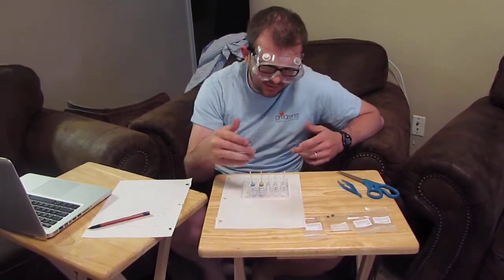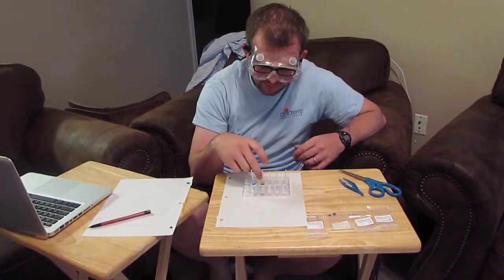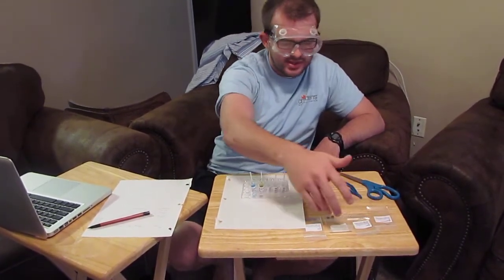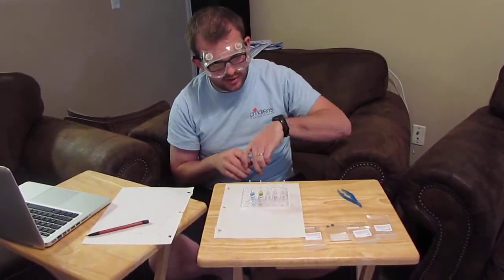What we're going to be doing is dropping 10 drops of each of these chemicals in A1, 2, 3, 4, and A5 in the well plate. And then we're going to come back and put my magnesium, zinc, lead, and iron in them individually, and we're going to observe the oxidation reduction reactions of the chemicals with the metals, and then we'll record them on a piece of paper. So we'll go ahead and get started.